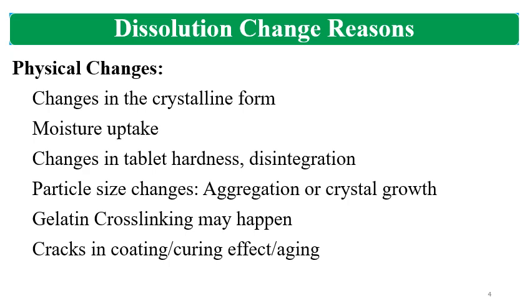See, these changes I have enlisted here are based on my knowledge, my understanding, and my experience. Some product specific reasons may also be there. So it depends on the formulation type and the stability studies, whatever is performed, which is product specific. Dissolution may also fail during the in-use stability study. So that will also be a significant change.